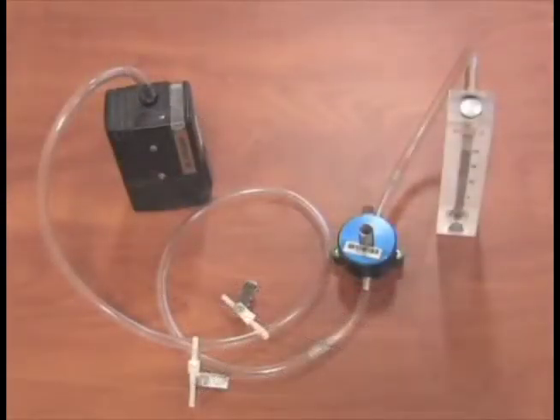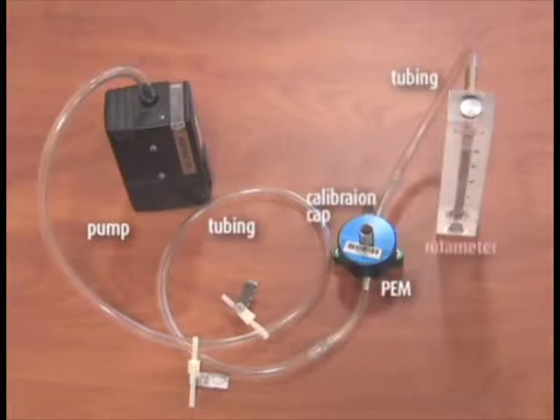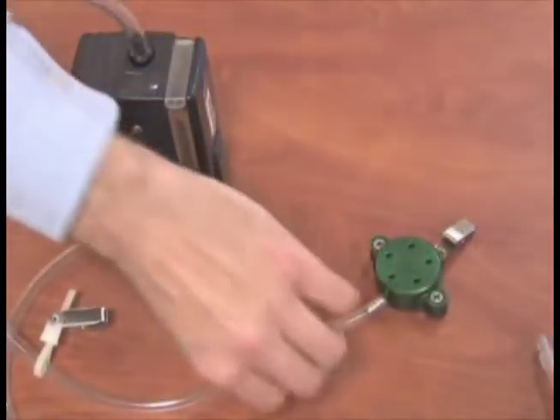Set up the pumps with the correct media in line, with the field rotometer as shown. The order of the components for calibration is: pump, tubing, PEM, calibration cap, tubing, and rotometer.